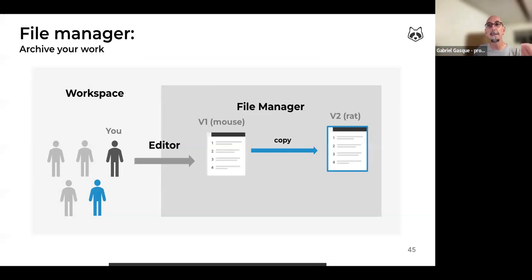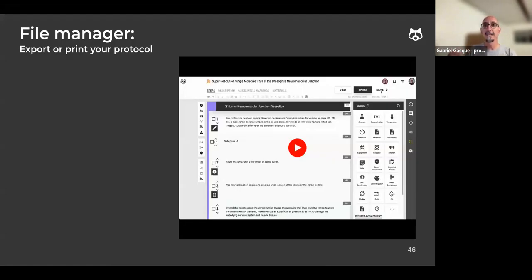And even if a member of your workspace leaves, because, for example, a student graduates, the protocols remain organized, up to date, and available in the file manager. You can also select to print your protocol or export it as a PDF.